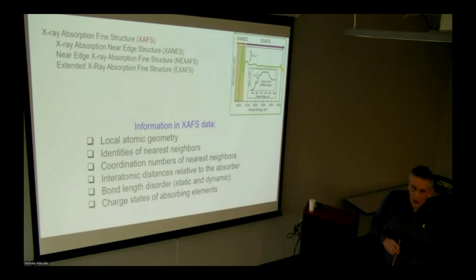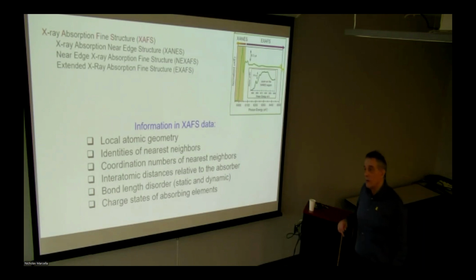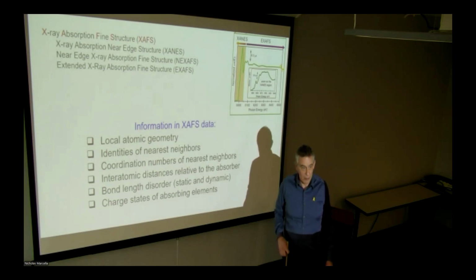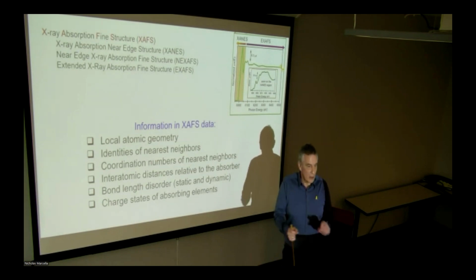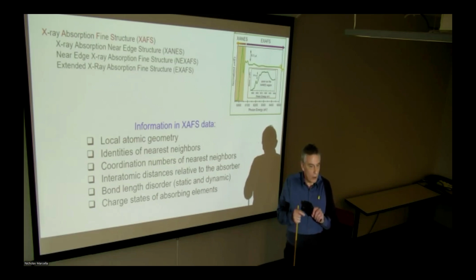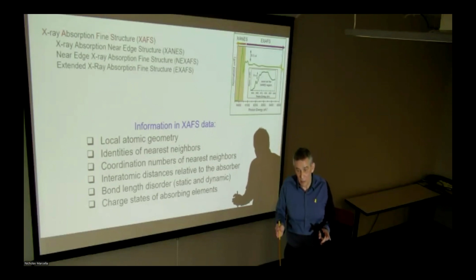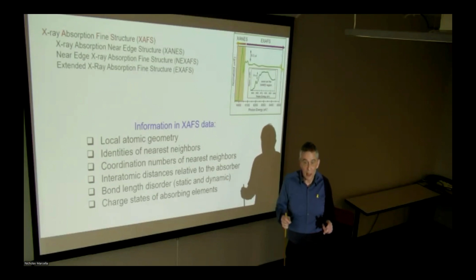You have another radii, sorry? So it's a different atom of different radius, which will change the distance to the neighbor. Ah, but that still converts into the distance. So if the distance itself is the parameter, then we already know how to get distance from the neighbor. The question is the type. Basically, in a hypothetical case, if you have a periodic lattice and you have either only palladium in the lattice or random substitution of palladium and gold, the distance will be the same. It's not a direct case in real material. I'm just making it up, but you still can tell.